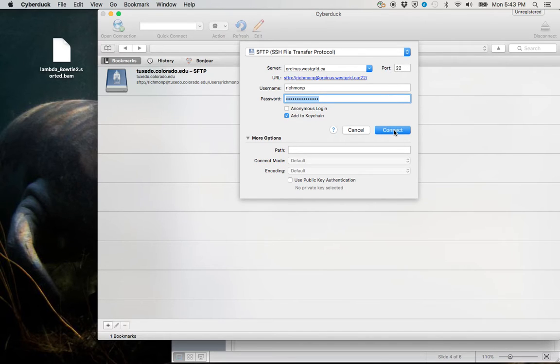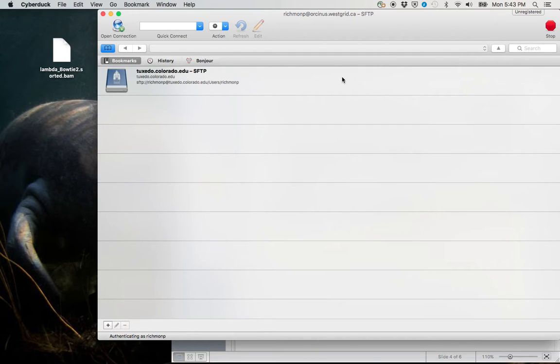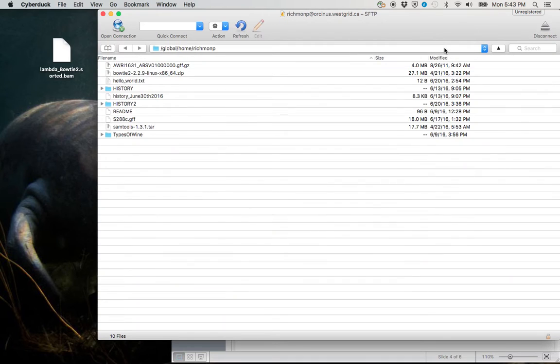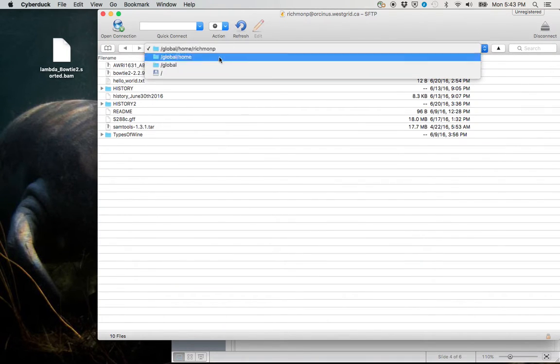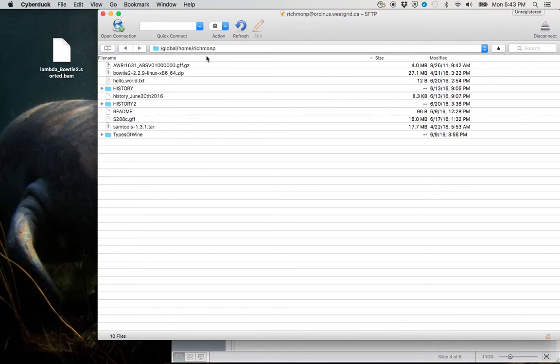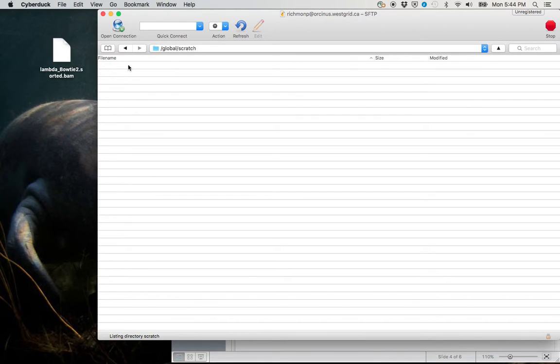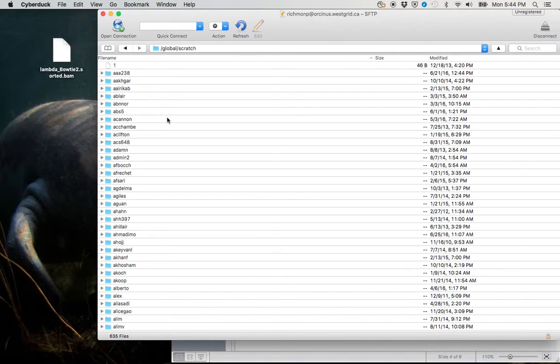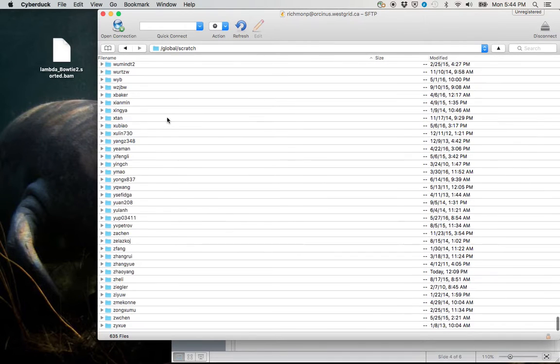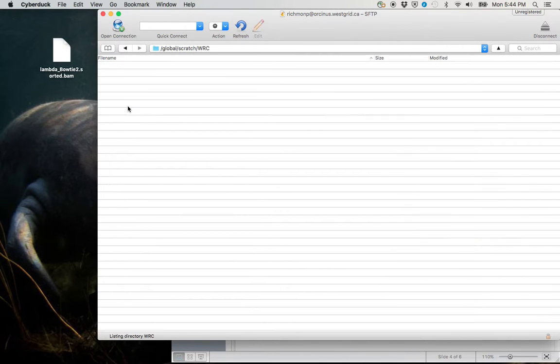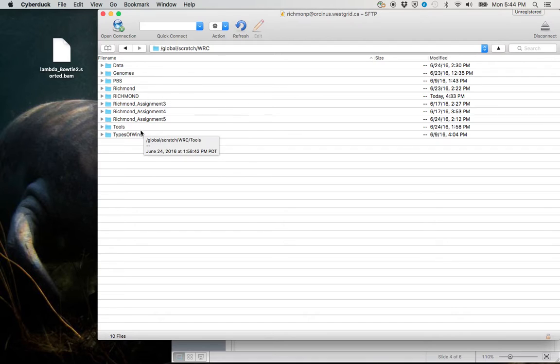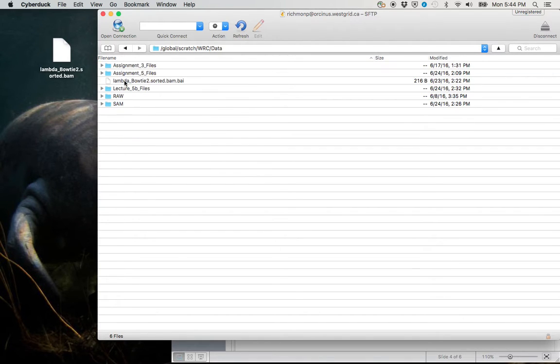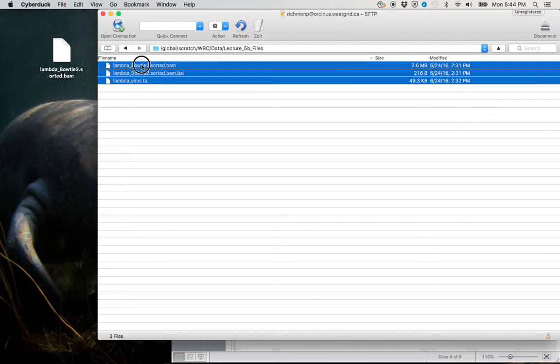Now it's opening this connection. And voila. Now you can see this is that global home directory that we're used to. And if we go back to global, we can also find Scratch. And if we scroll down from Scratch to W, you can find WRC. Now the place that we need to look in is Data, Lecture 5B files.